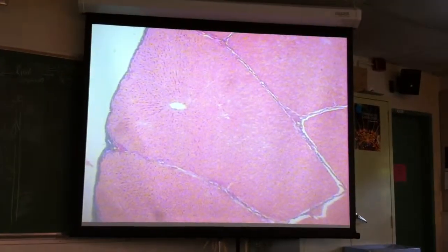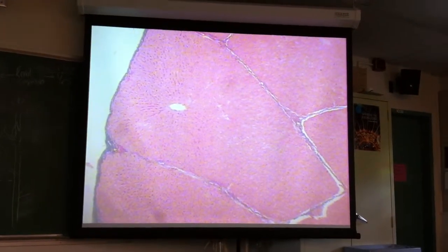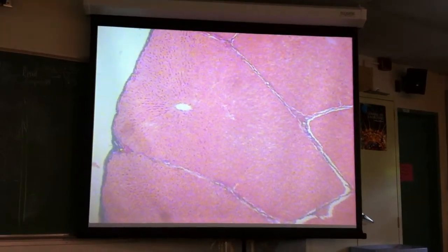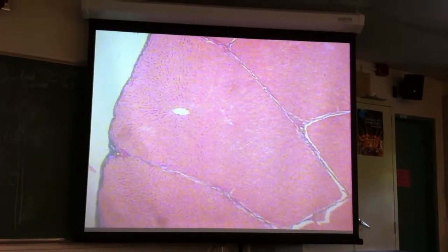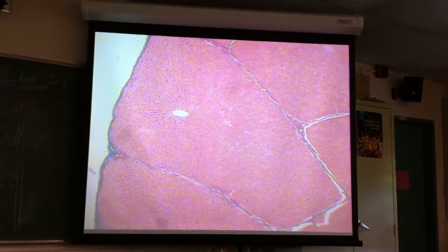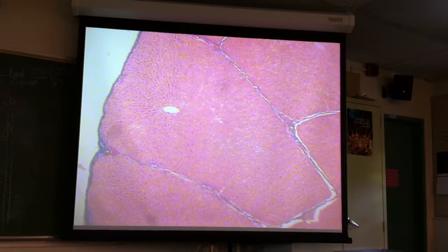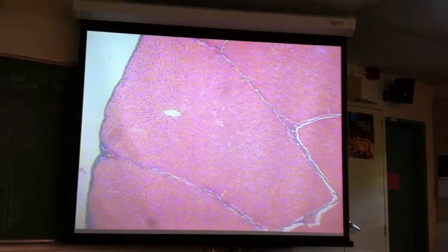Okay, you guys, I happened to get lucky and grab a really good slide first off. This is the one that's labeled liver of pig. It's an old slide. The label's really, really faded. There are some newer ones that stain pretty much a uniform pale pink and can be a real challenge to try and get a handle on.